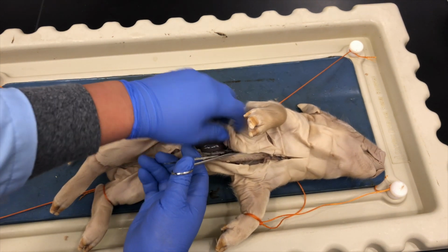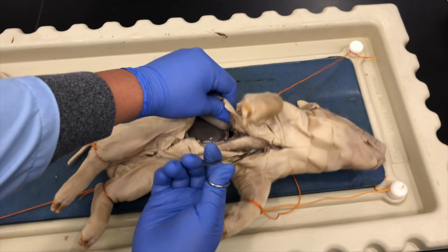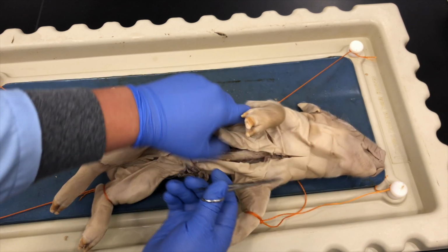Here I used a pair of scissors for better control of the cutting.